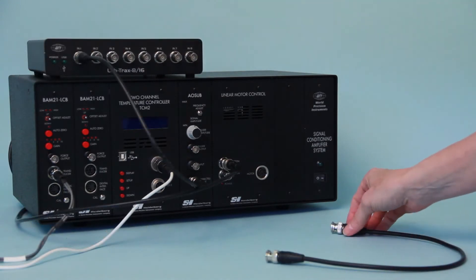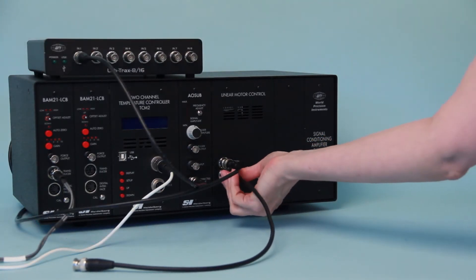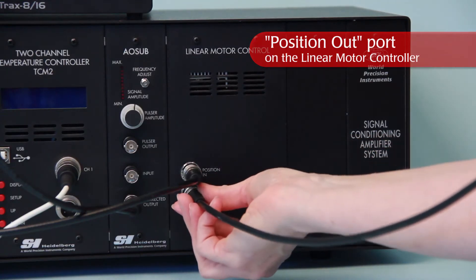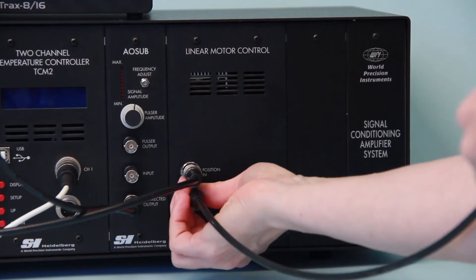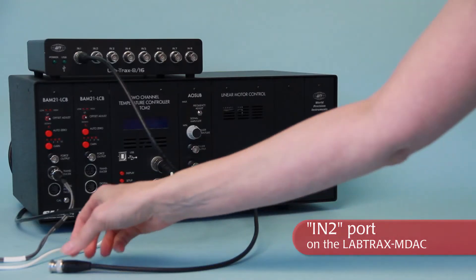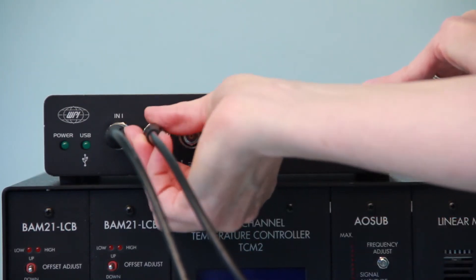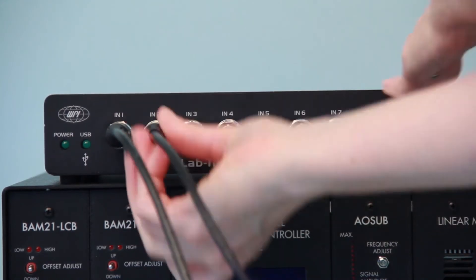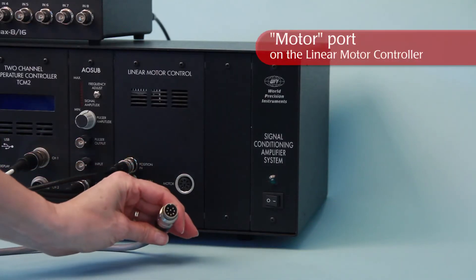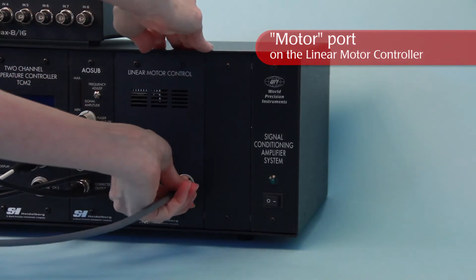The position of the motor is monitored by an output of the position control module. Connect a BNC cable to the socket on the front of the position control module labeled position OUT. Connect the other end of this cable to another analog input on the data recording device designated as the motor position channel, like the N2 connector on the front of the Labtrax MDAC.